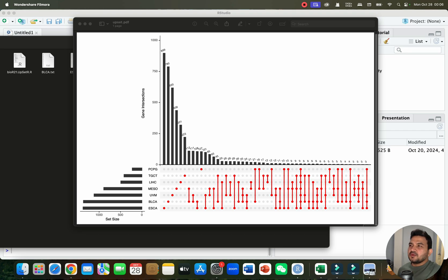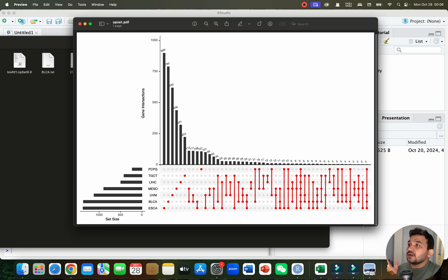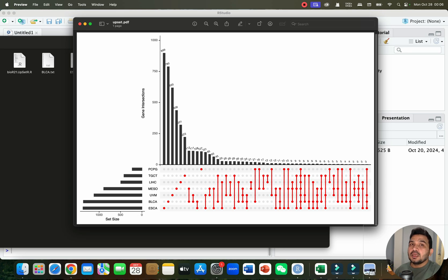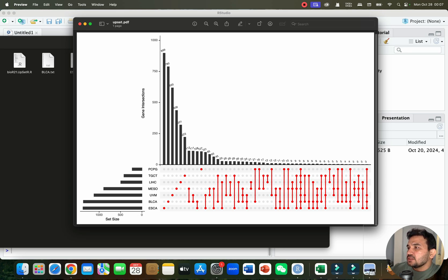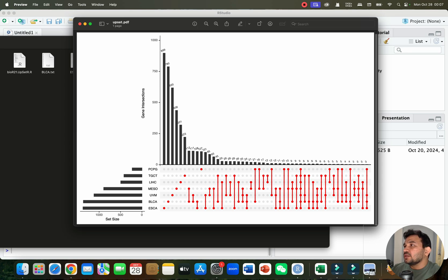Welcome to another video tutorial. In this video I will show you how we can draw an upset diagram using R. As we know, this upset diagram is super helpful to find the common genes between different datasets. I will be using R to develop and find the common or intersecting genes between the different datasets.